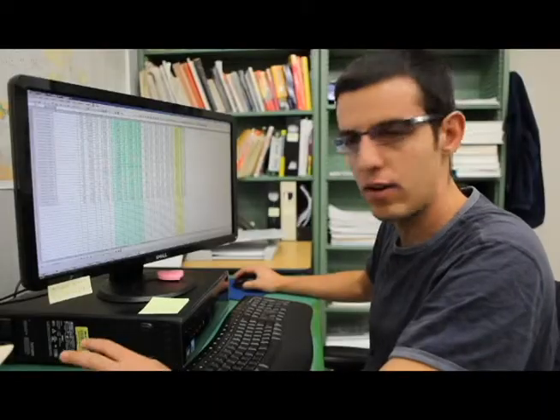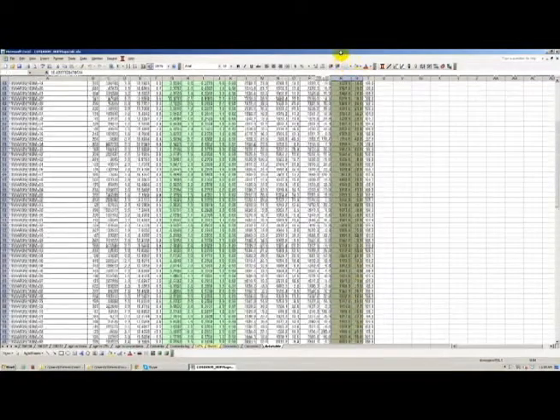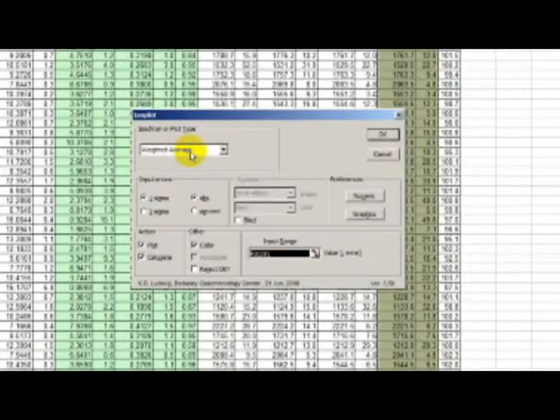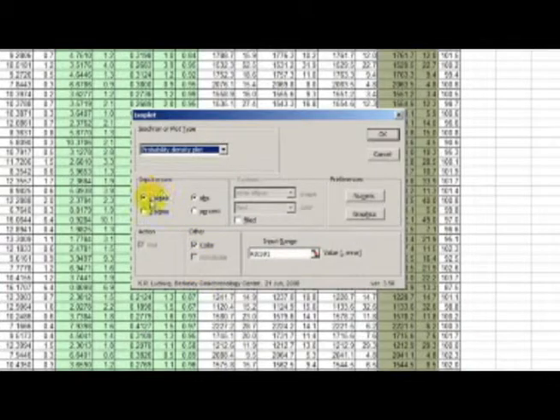Okay, so last of all, to make a probability density plot, you want to highlight all the cells that are in yellow, then go back to your Isoplot icon. And now here, for the plot type, you're going to select probability density plot. The input errors are 1 sigma and absolute in this case. So remember that for the Concordia diagram, the input errors are in percent, but here now for the best age, the uncertainties are in absolute values.